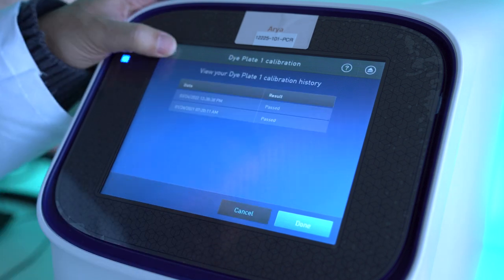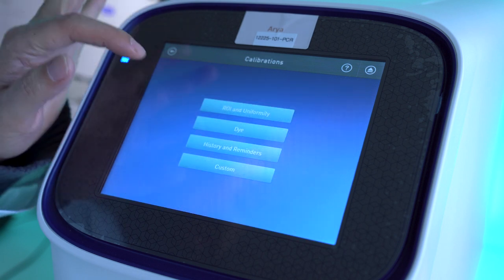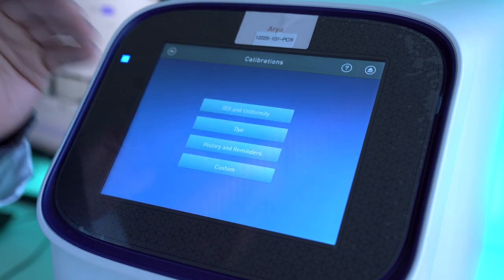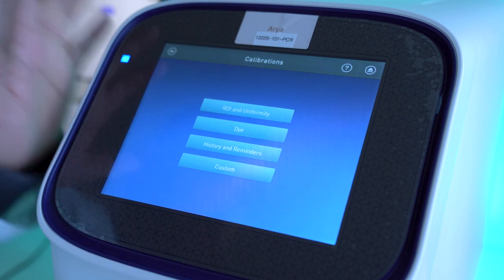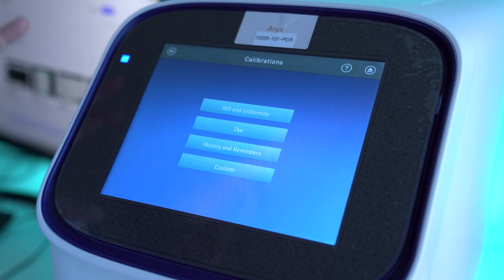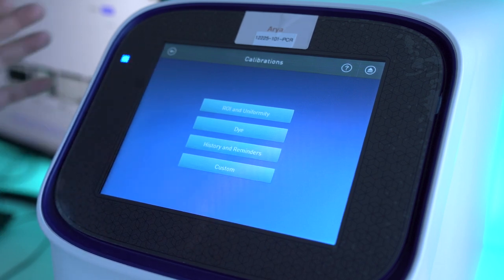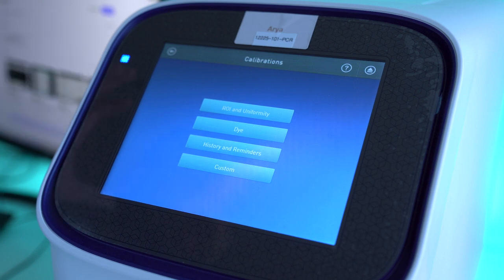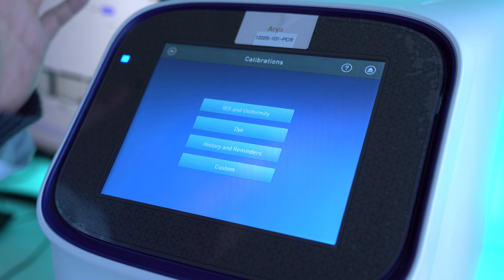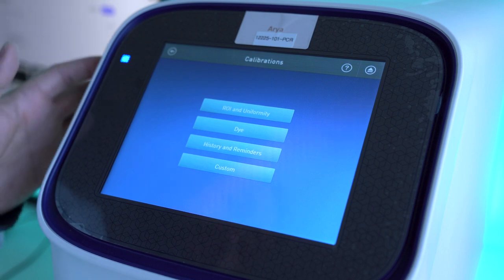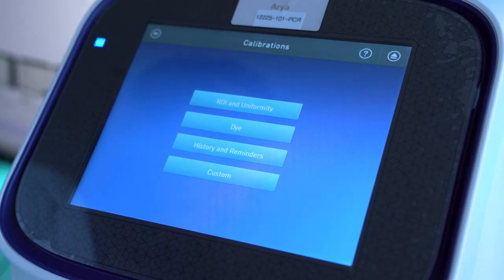A few things to keep in mind when calibrating: if you calibrate regions of interest or the dye and you did that mistakenly, you cannot roll back this unit to the previous state. So make sure you have good dye plates and you're ready to go. If you accidentally calibrate based on the wrong dye plate or don't finish the calibration, you've bricked your unit and it won't work until you get another dye plate. You have one chance to hit Reject after it finishes, but if you accept it, that's it.